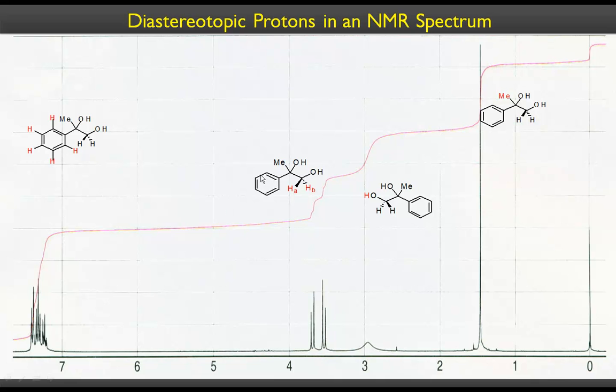And the aromatic protons couple to each other as well, but you need to have a powerful magnet to see this kind of splitting pattern in the aromatic region. If you have 60 megahertz, you just see a big multiplet here, or a big hump. When you have a higher magnetic field, you can see ortho splitting, ortho coupling, as well as meta coupling, and to some extent para coupling, right? So, and moreover, the integration is 5 to 2 to 3.